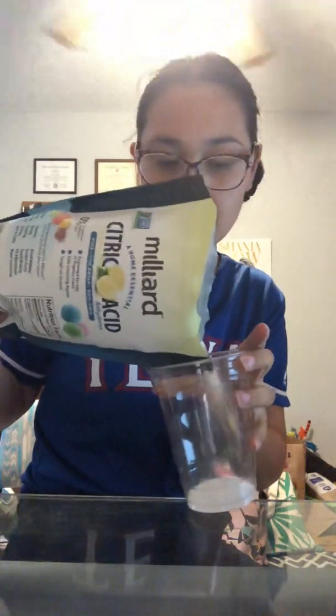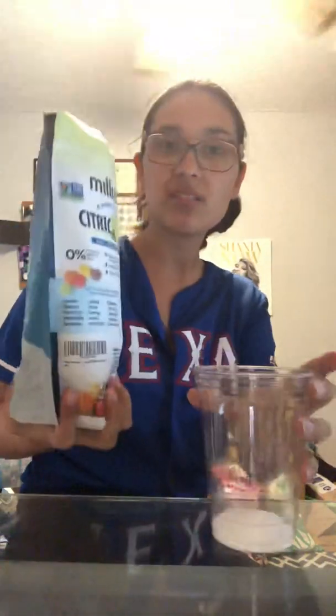Citric acid is kind of like what they put into gummies, like fruit snacks and stuff like that. It smells really good. It looks like it's crystallized. It's white. It looks like sugar also, very similar to magnesium sulfate.